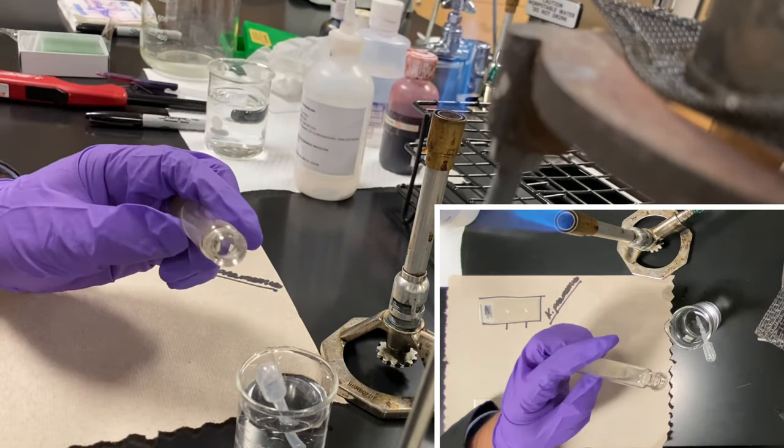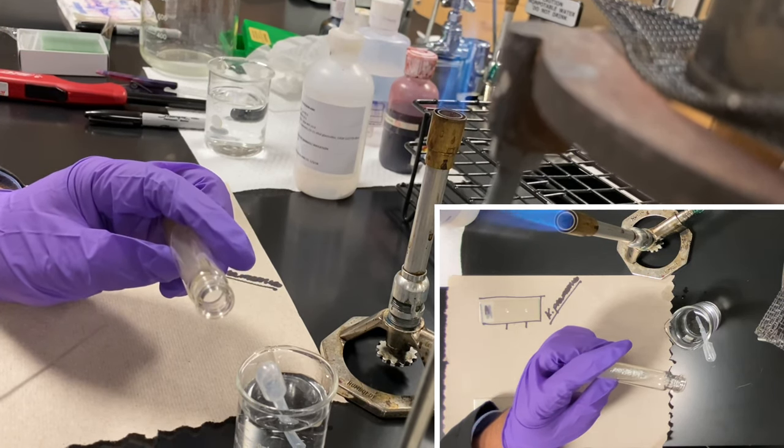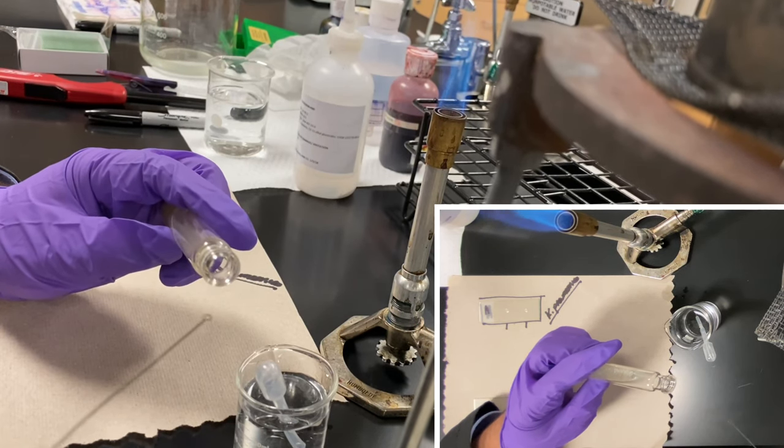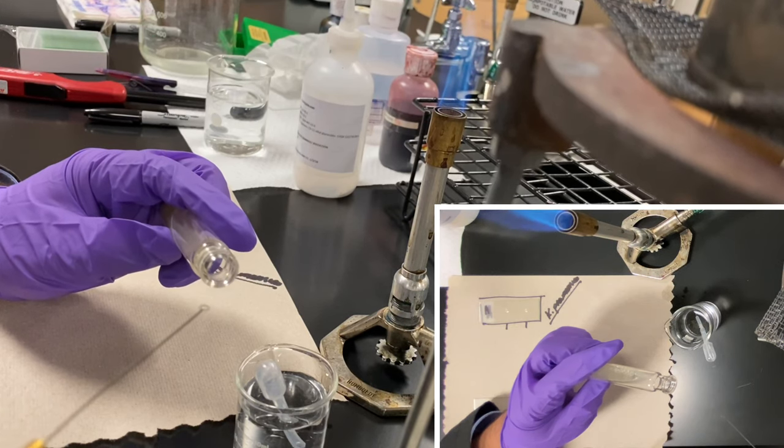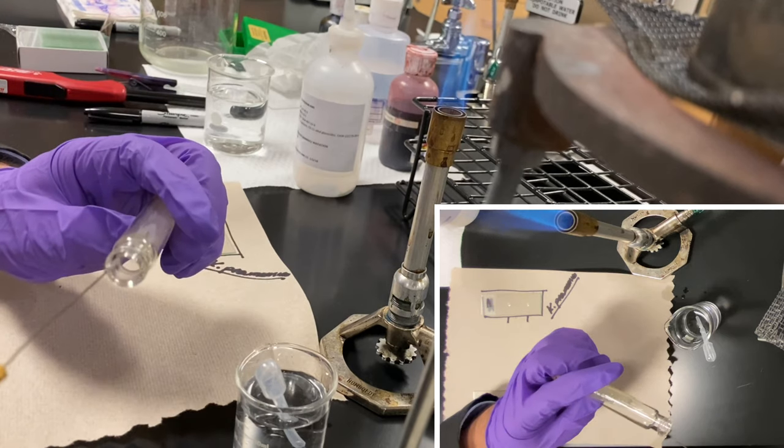After about 15 seconds, I'm going to pick up a tiny little amount. I want to make sure I wait 15 seconds or more to ensure that my loop is sterile and cool. If I don't, it will kill the organisms when it touches in there. So 15 seconds have passed.